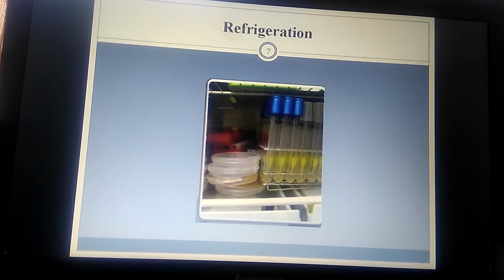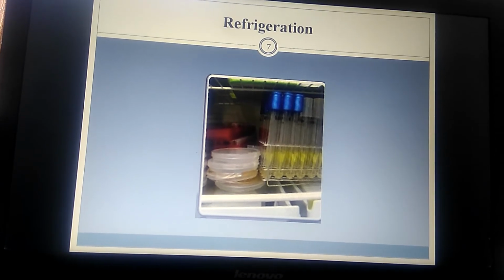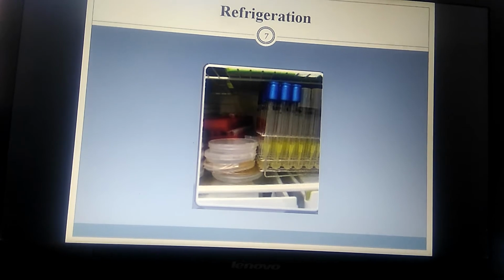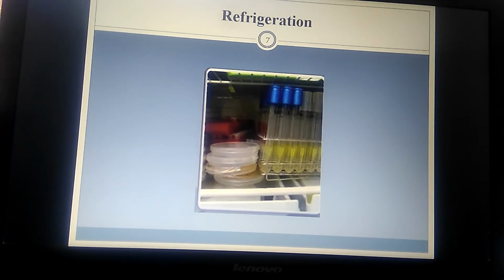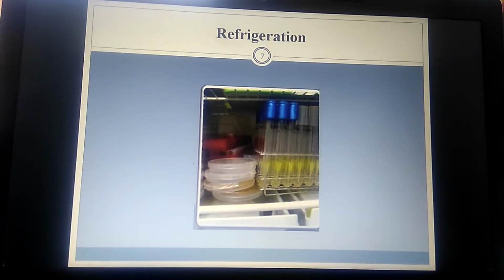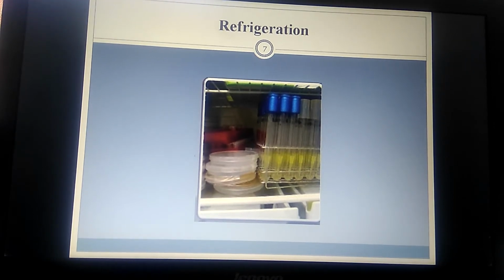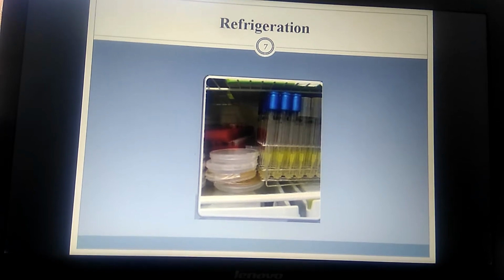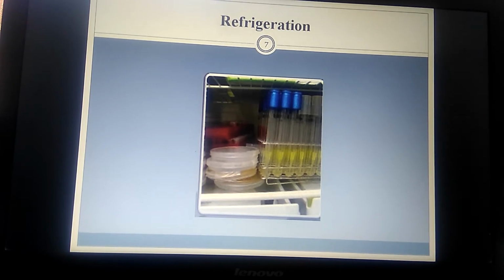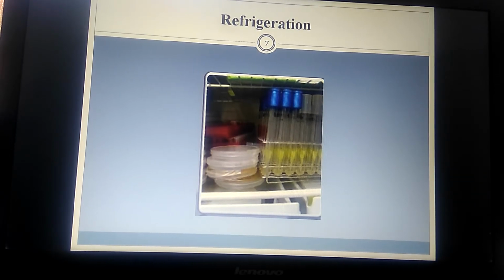You know why? Because in refrigerated conditions, the water will be taken up. That is how it is refrigerating, for any food or anything, and the same happens to the media present in the agar, the slants or the broth cultures. So the media will dry up, and the organism present in there is still living, so it will be taking up the nutrients in the media. So nutrients will be depleted, and after a certain time the organism will start dying because of nutrient deprivation and no water. So this is one of the problems in refrigeration.